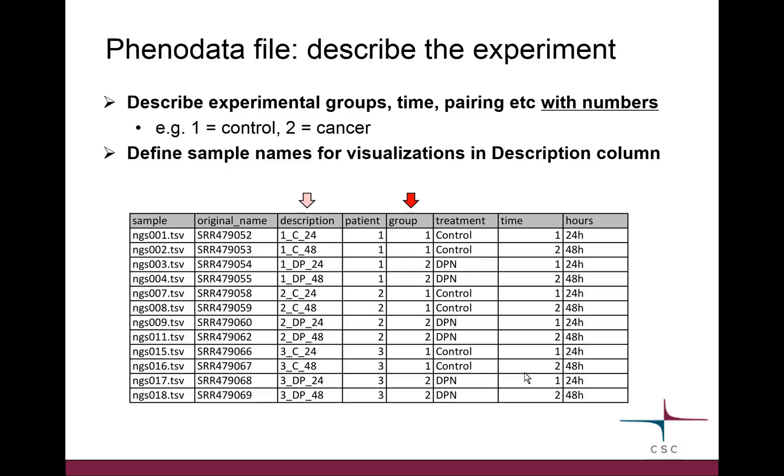When you open it to look at it, you will see that there are various columns ready-made for you, but then you can also add columns. You are free to add as many columns as you need to describe your experiment. But I will point out some important columns. The most important one is the group column, which is there already to start with. This is where you describe to Chipster which sample is a control sample, which one is a treatment sample, whatever your experimental setup is like. If you have more than two groups, you just give more numbers. Basically, the samples that belong to the same group get the same number here.